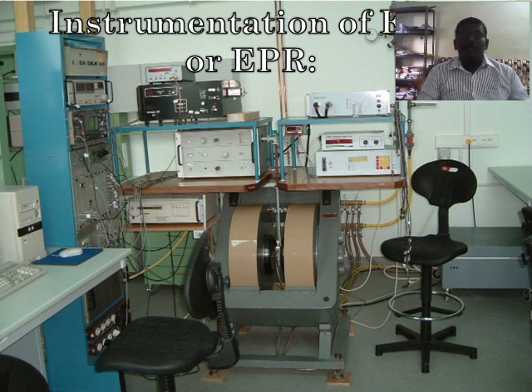NMR uses radio waves, but here we use microwaves. The ESR range is 9000 to 10,000 megahertz. This is particularly useful for studying metal complexes or organic radical complexes. So this is a very important spectroscopy, and the instrumentation of ESR is very important.